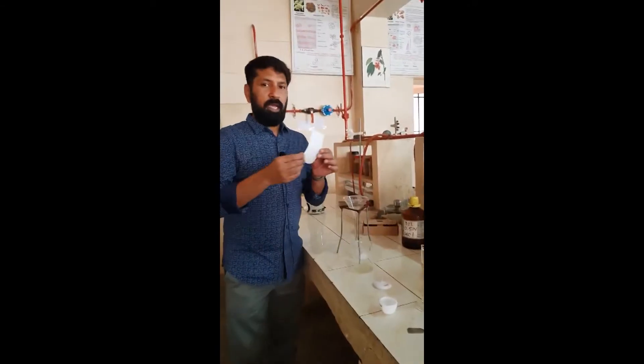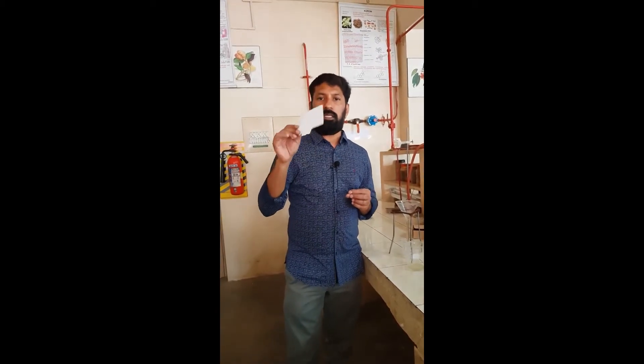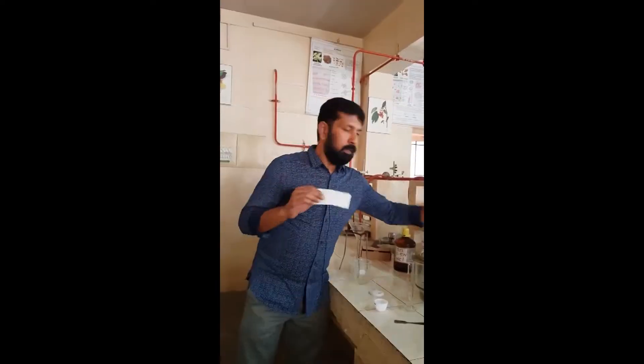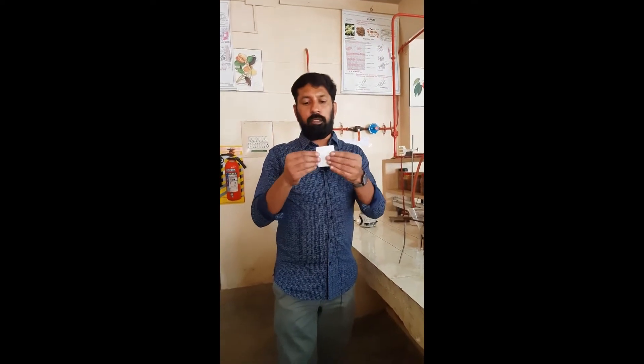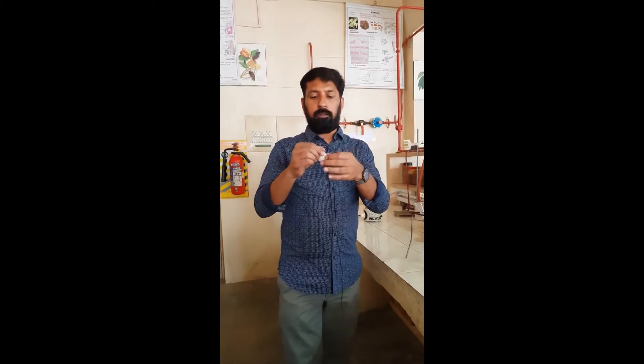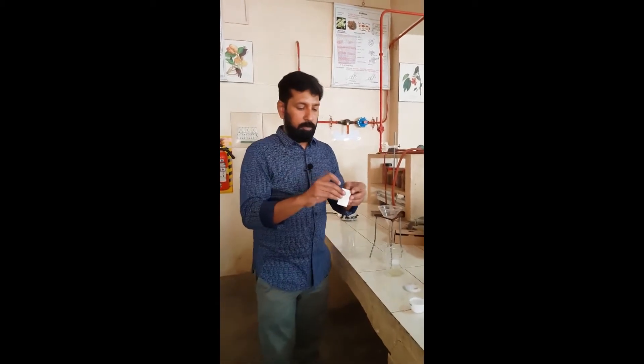Now what we have to do: take one ashless filter paper. This is the ashless filter paper. What is the advantage of ashless filter paper? If you heat this ashless filter paper and burn it into ash, it does not give any ash. This is a normal filter paper — if you make it into ash, it gives ash. But the ashless filter paper does not give any ash. Now take this ashless filter paper and fold it into 4 parts. Fold it and keep it in the funnel, then pour this solution into the ashless filter paper slowly.